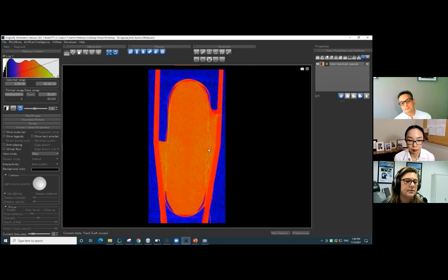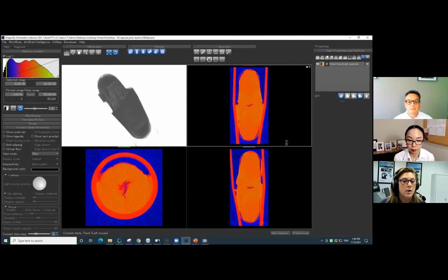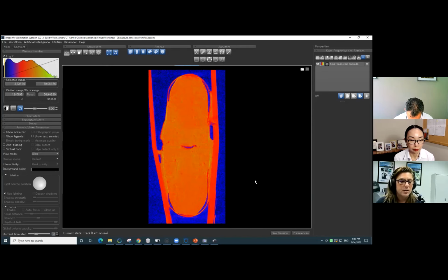And this is the dissolution of the pill that we can see a little bit better by using different coloring. How about the next time point? Well, you'll see in this case, this crack or void in the middle happens much faster. That's probably related to the amount of water or the location of the water. And you also see, again, some bulging here of the outside portion where these end caps are located.